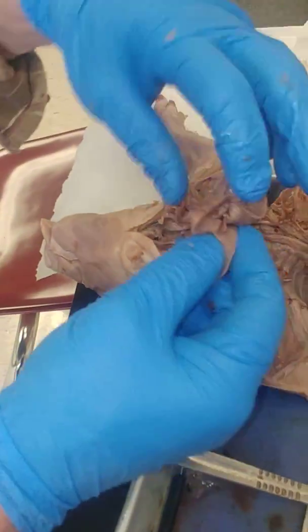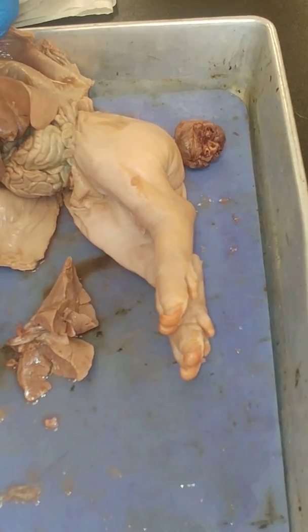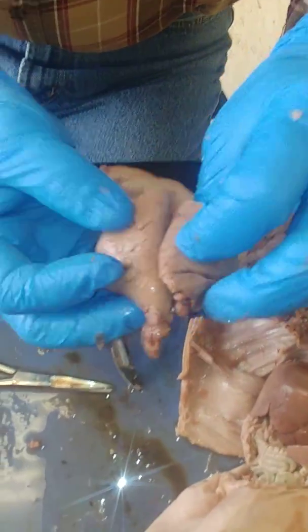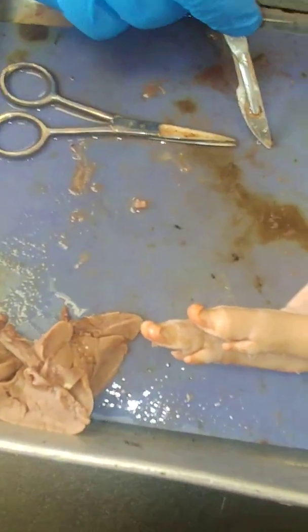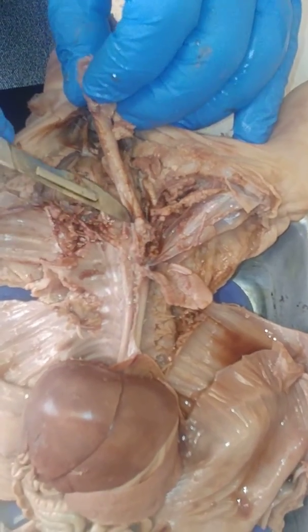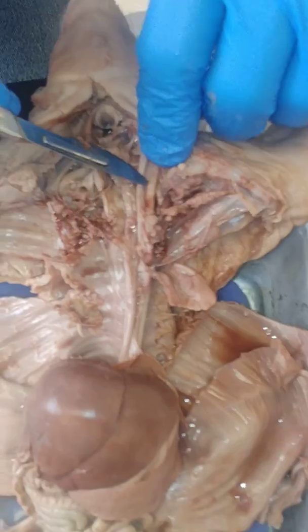And so this will give you an idea, oops, there's our right side. Let's get the left side here. With our lungs, then on the back side, this is what the lungs would look like. Okay, and what I was talking about, this was a trachea that was hooked up to the lungs. And you can see it's just a little hollow tube.